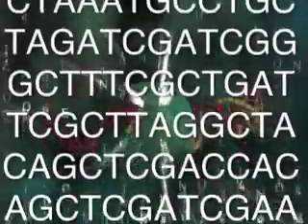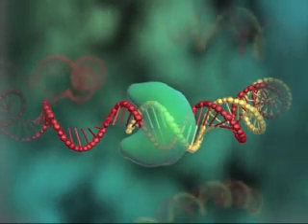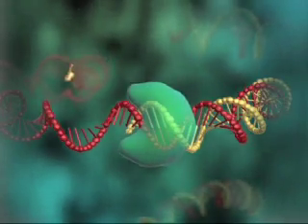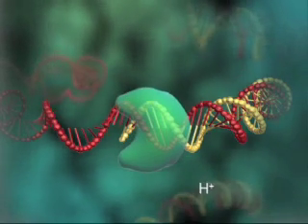The other half of this technology is based on a simple and well-characterized biochemical process. In nature, each time a base is incorporated into a strand of DNA by a polymerase, a hydrogen ion is released.